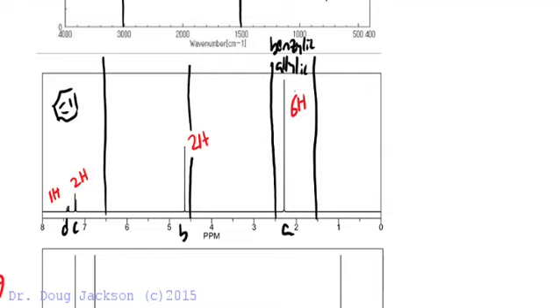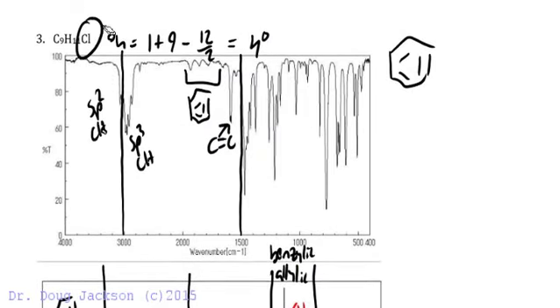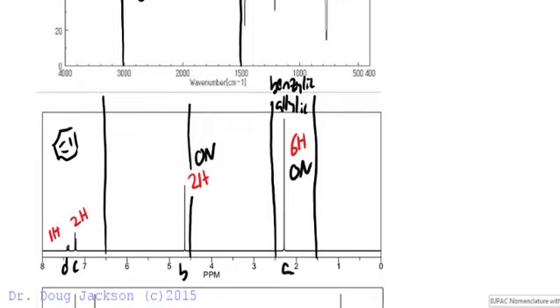So we have 0 neighbors for these 6, so 2 CH3s with 0 neighbors, and then 2 H's here with 0 hydrogen neighbors, and they're deshielded into the double bond region. This is the vinyl region, although we can't have a lone double bond in this compound because we're out of degrees of unsaturation. All 4 were accounted for with a benzene ring. We know that we also have in this compound a chlorine. So we've got some effect of a chlorine next to a benzene ring and a CH2 that's deshielding this, with no neighbors.